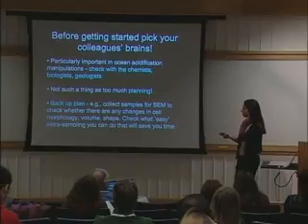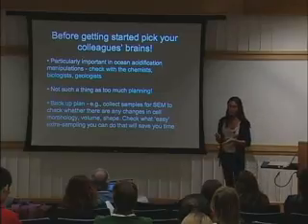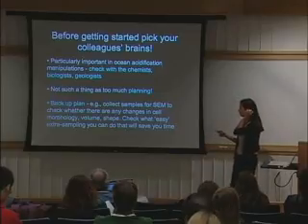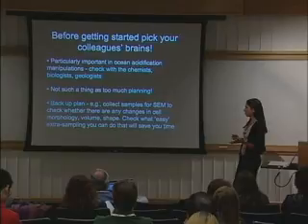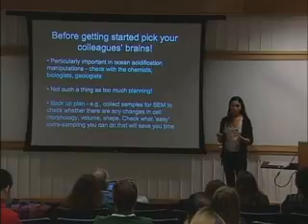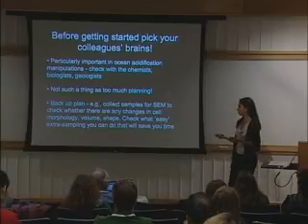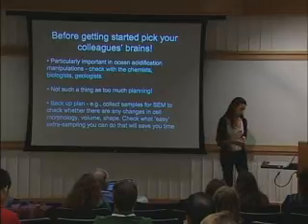And then something that we try to do is, based on these kinds of conversations, we have a backup plan. So we collect extra samples for different things. One example is to collect samples for SEM or samples in formalin or glutaraldehyde. You can always analyze them later. So even if you are not thinking of doing any morphological work, it's a good idea to collect these samples, and if you have any problems with interpretation, you can always go back to your samples.